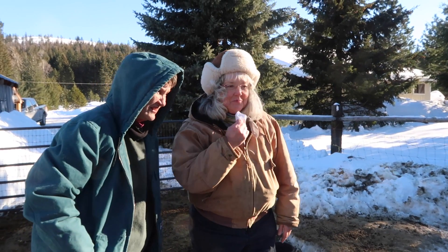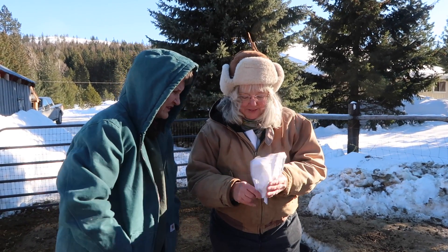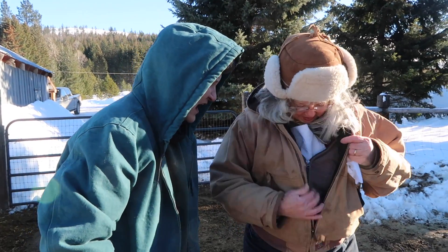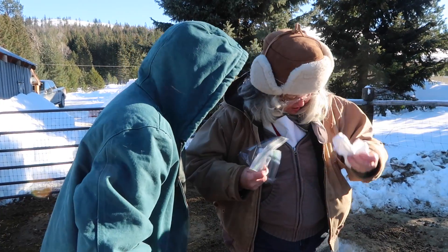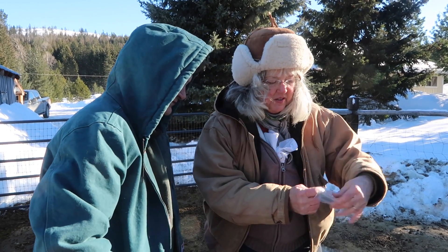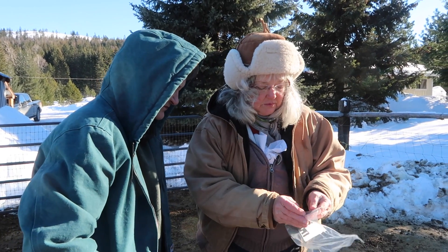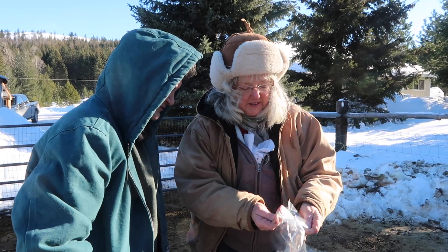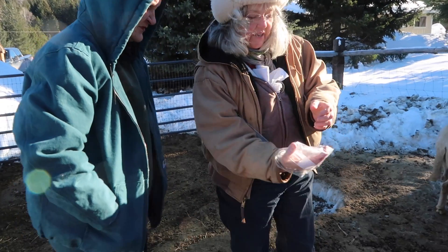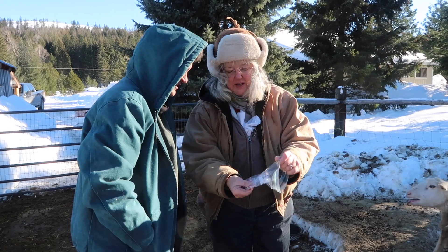My other task for this morning is the fecal egg count stuff. I have some bags for you because you guys probably want bags and stuff too. Here's one way to do it — just go like this, catch whatever comes out, and then put it in like that.